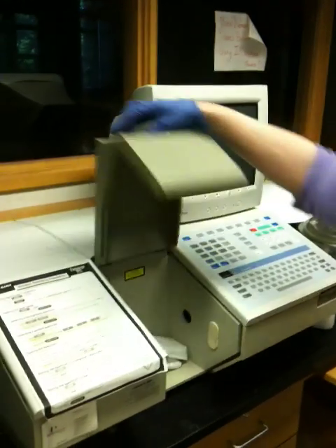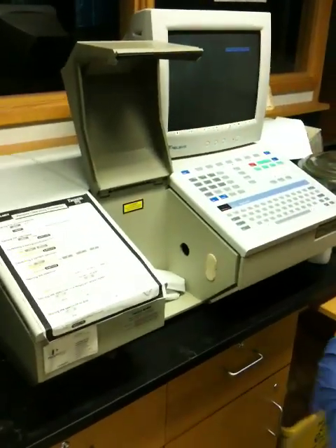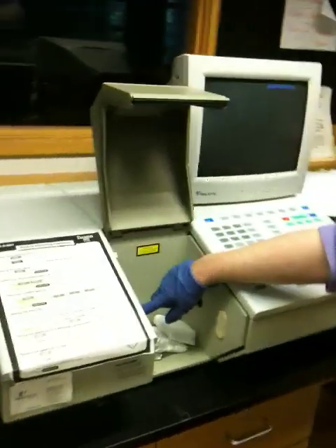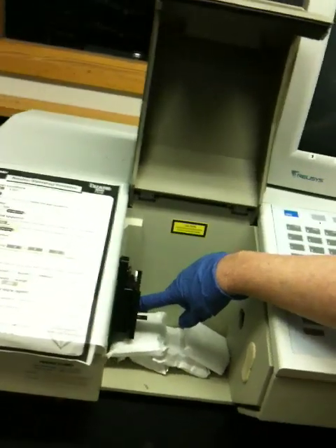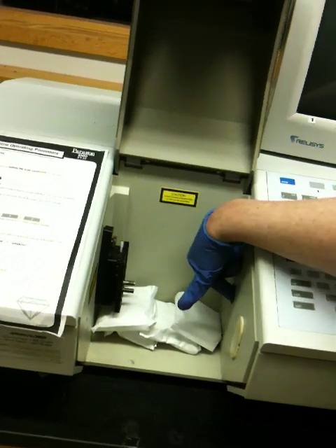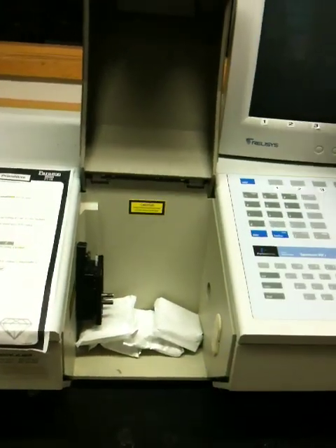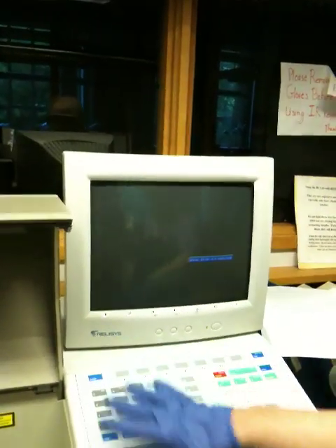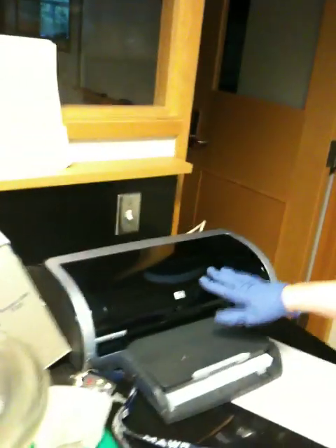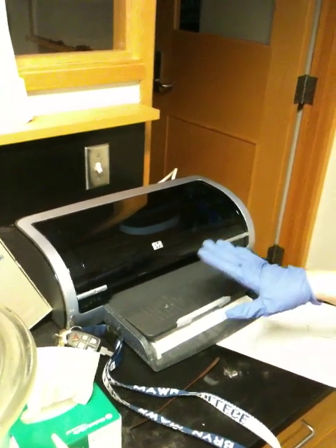Now, the instruments always run open, and there's a reason for that which I'll explain later. This is the area where the beam of infrared radiation comes out. The sample sits here, and it passes into a detector that's on the other side. This is a computer screen, and this is the keyboard for the computer. Over here we just have a very basic printer — we do not print in the NMR room, we print right here. We have two of these; there's one on each side of the room.